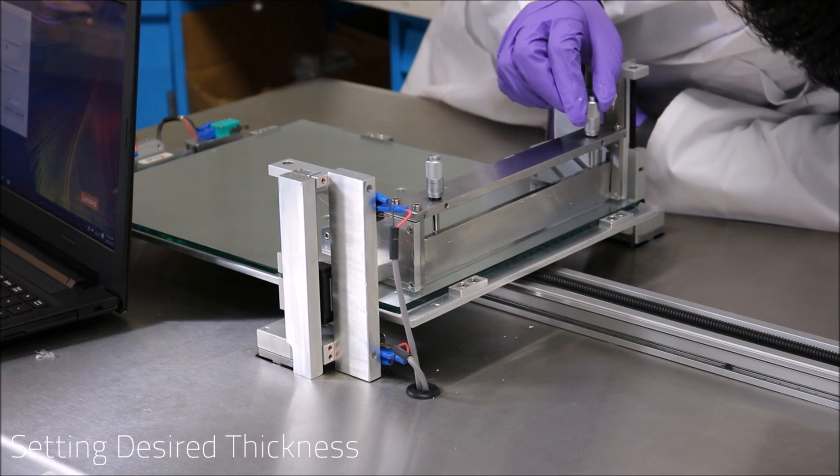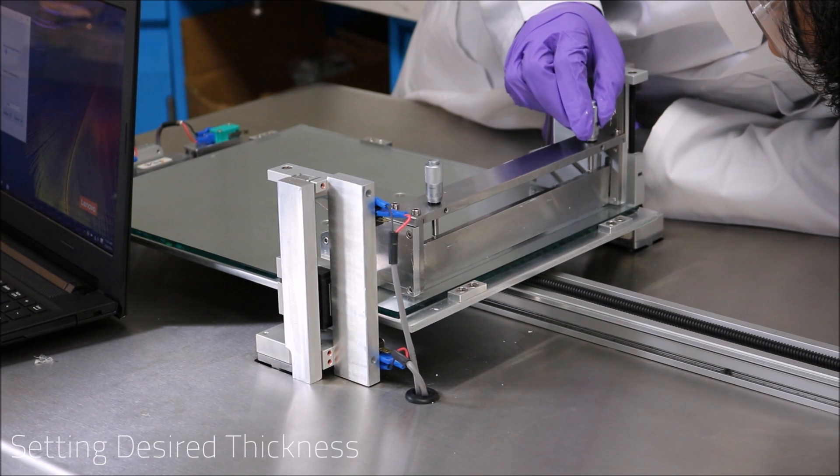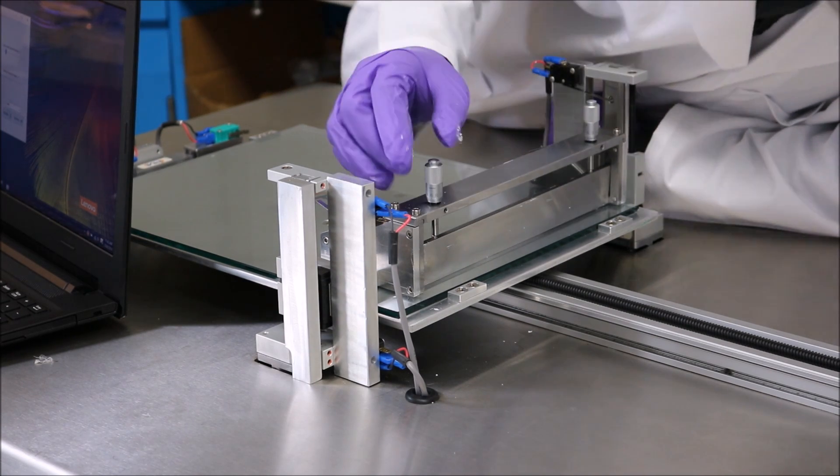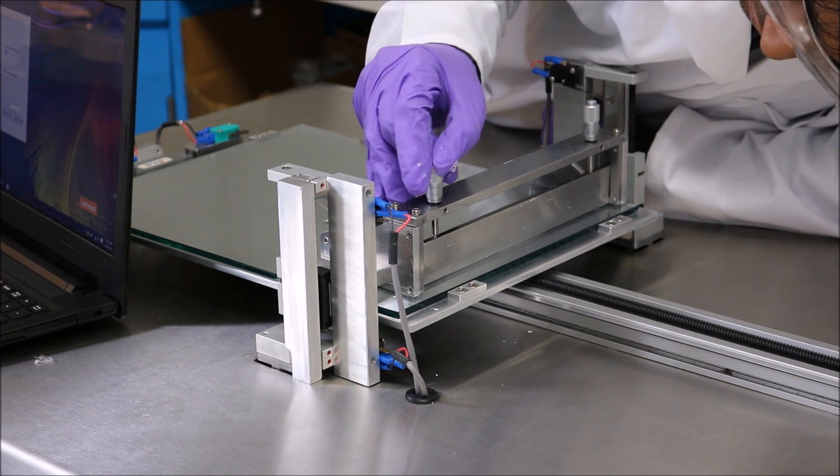The next step with the doctor's blade involves establishing your desired thickness. This can be done by simply fine tuning the micrometers on either side at the top of the doctor's blade to whatever thickness you would like.